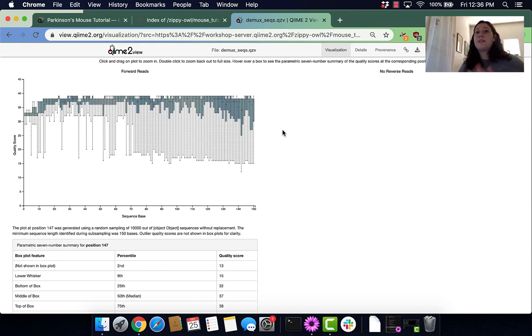So what did we learn today? We learned how to import data, how to visualize the demux.qza file, and how to read it, as well as start to understand where might be a good place to trim and truncate our data. Thank you guys so much for listening and I hope this was helpful.